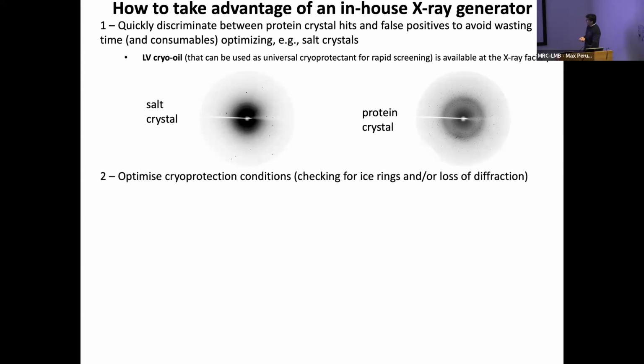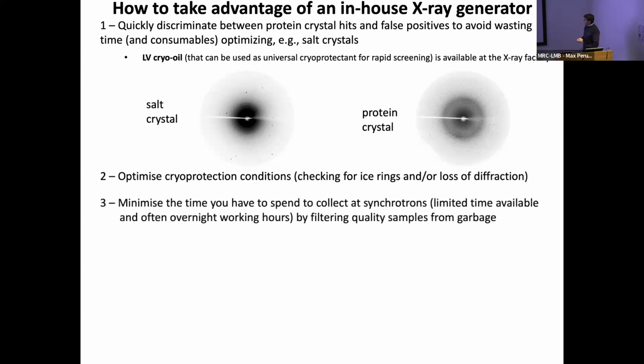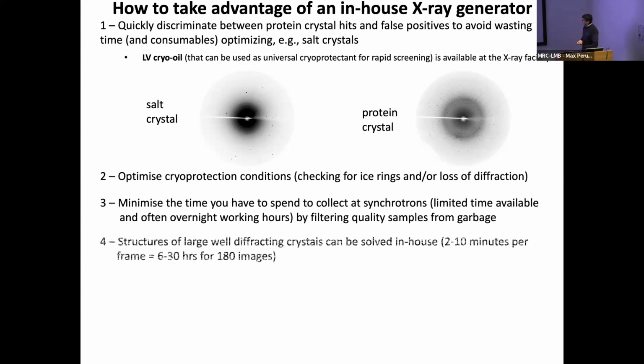Of course, it will also help you to choose the cryoprotection conditions. You might want to use different cryoprotection. You want to test, because some cryoprotection will destroy your crystal, and some will destroy your diffraction despite the crystal still looking good. So it's a nice way to optimize before you send the crystal to the synchrotron, which will help you minimize the time you spend at the synchrotron, which could be at night. Instead, here you can work during the day, in sociable hours.